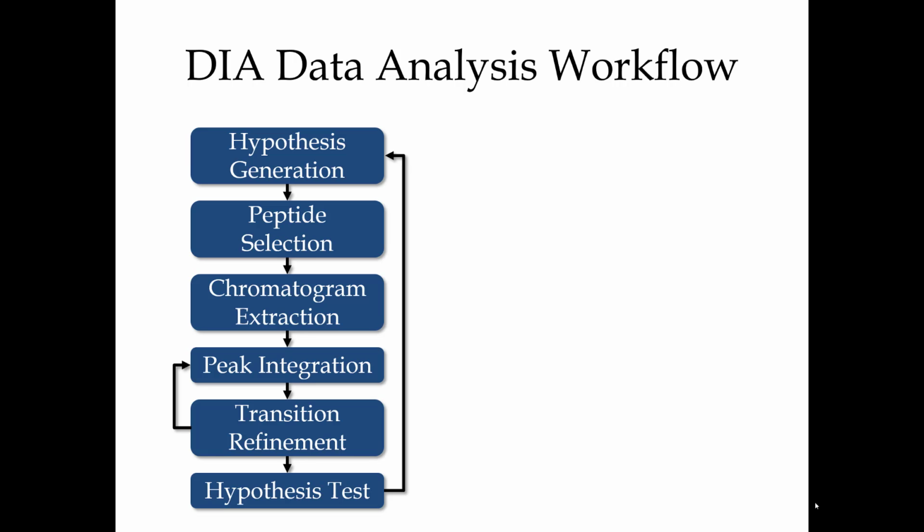All your experiment has to happen, but once you've got the data, it is sort of a permanent snapshot, and we can argue about what the resolution of that snapshot is, how good it is, and certainly if in 3 years from now mass spectrometers come out that are way faster and can sample everything at 1 Dalton, which sounds doubtful from what I'm hearing from the instrument vendors, but if that were true, then the snapshot would not be very good, and it would be like looking at a photograph from an old microscope. It wouldn't be so great.